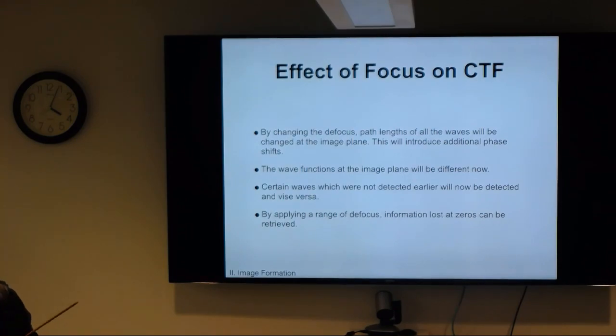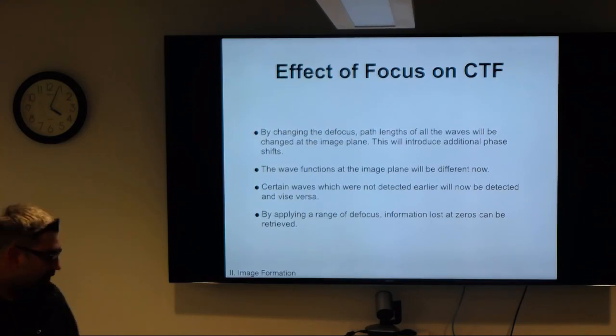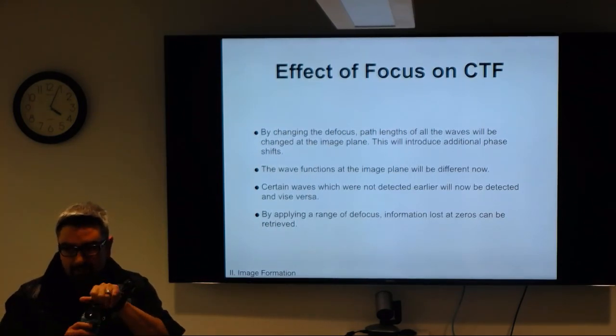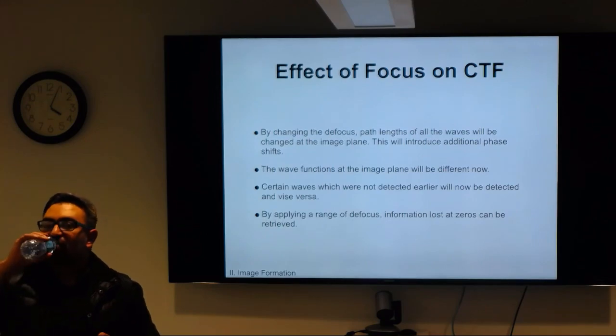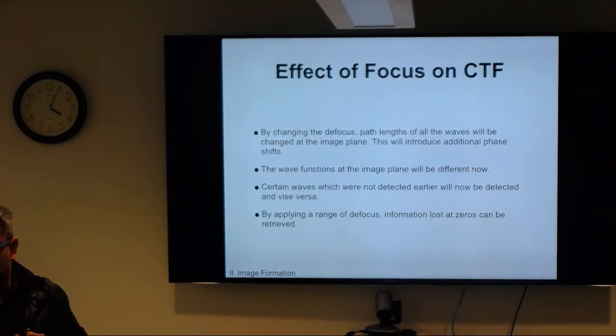So going back to the last point that you repeated, when you collect cryo-EM single particle data, you usually collect your data across a range of defocuses. So, -1 to -2, and that's so you can retrieve all of those zeros that you lose. But inherently, some people, instead of just doing a defocus range, just set one. And it's always going to be a function of how well you find zero focus.